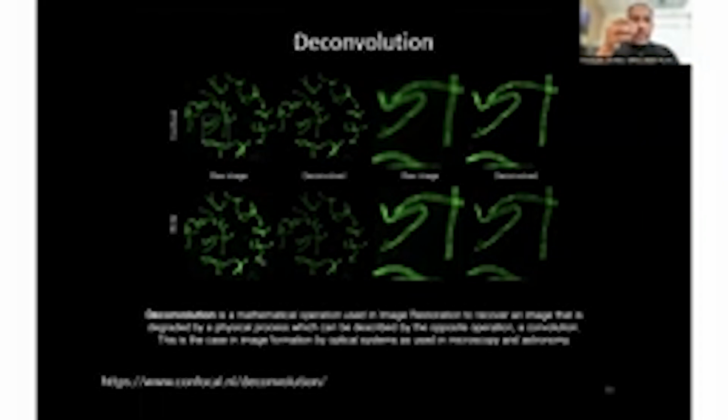If this is where the light source is, but when you record the image, you're seeing fluorescence in this neighboring region, how do I determine that this is the specific light source and remove all of this and let you see only this much? This can be done mathematically now.